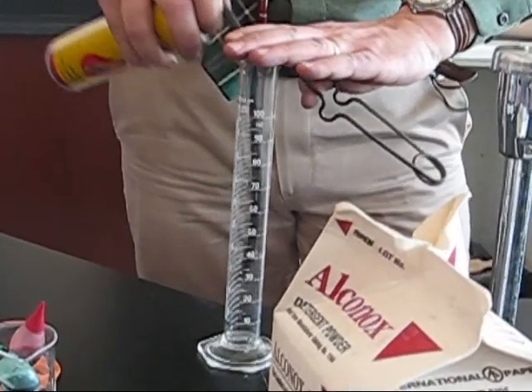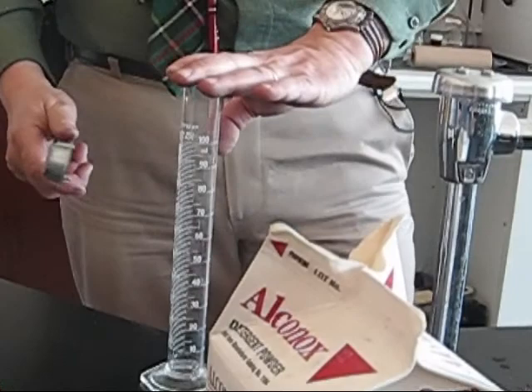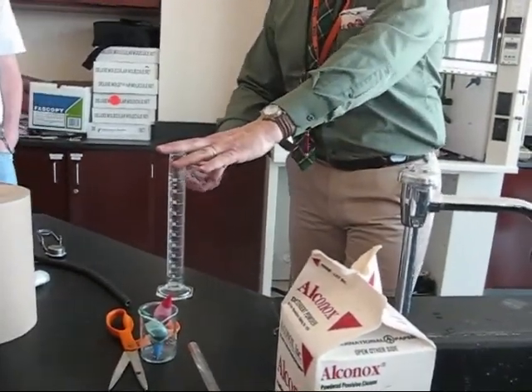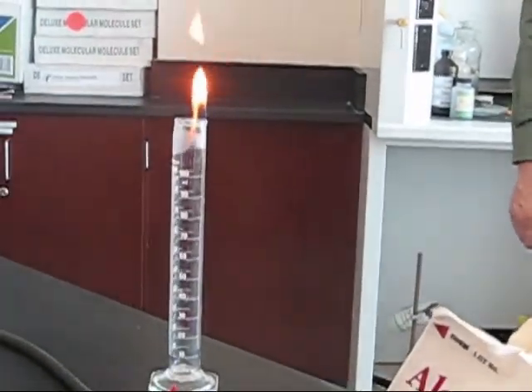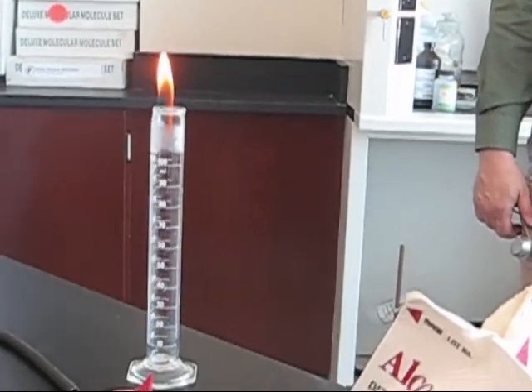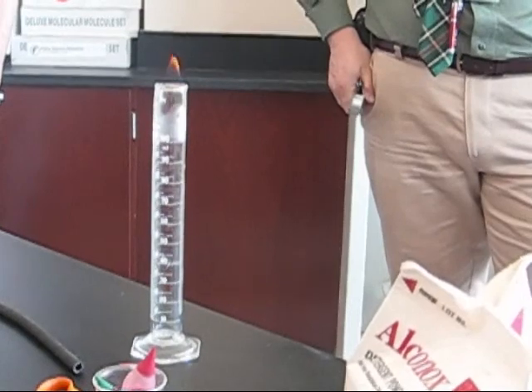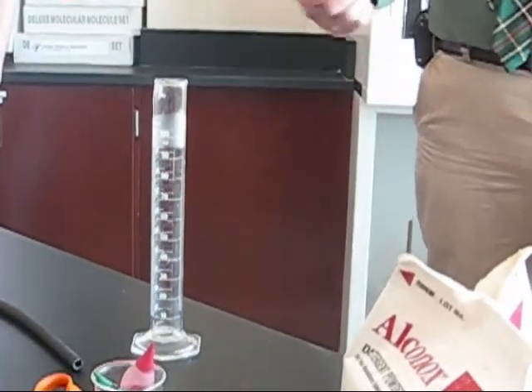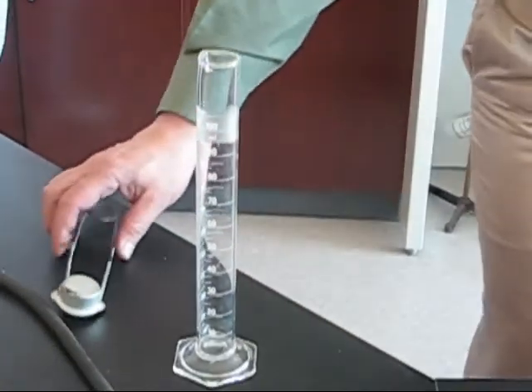So, I might have seen some of it coming out. Did you notice that? Yeah. Little squiggles. Okay. Back your head. I step back a little bit. Like that. And there it is. Oh, dude, that is cool. That's crazy. Yeah, it'll go. Hopefully that's Pyrex, so that should be withstanding that heat. But you can see it sort of burning down. And the butane, of course, will diffuse up through that air column and burn. So that's about all really there's going to be to that one.